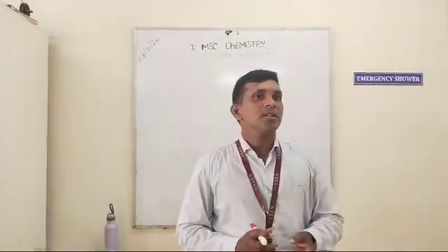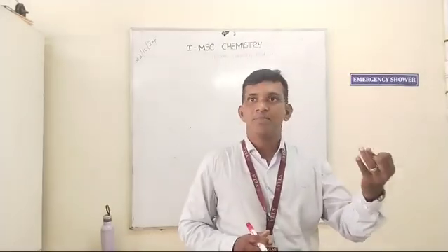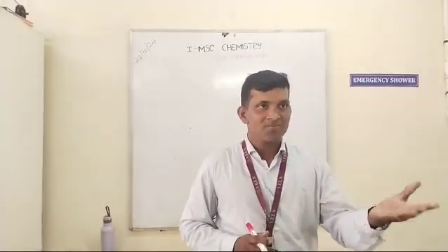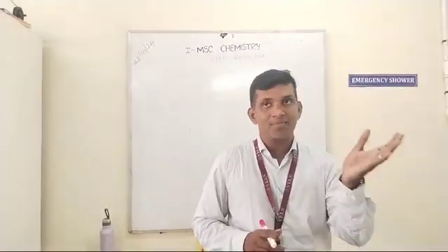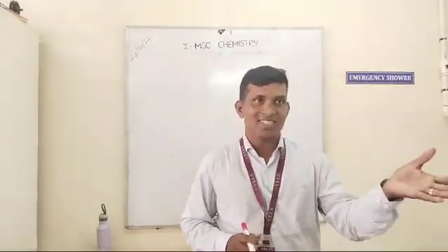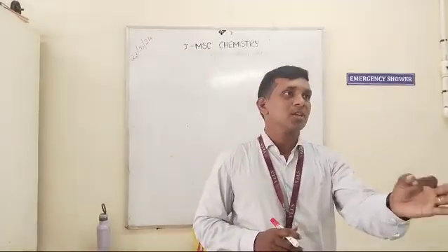So, first point, we have some classifications of mixtures. We have acidic plus phenolic mixtures, acidic and neutral substance mixtures, and acidic and water soluble substance mixtures. Another type is phenolic plus neutral, and phenolic plus basic substance. Okay. For example, I am giving an acidic plus phenolic compound mixture.